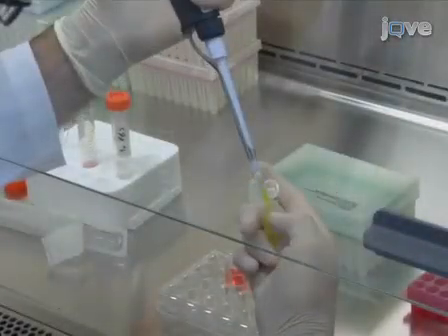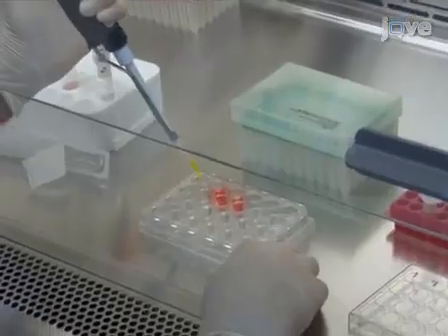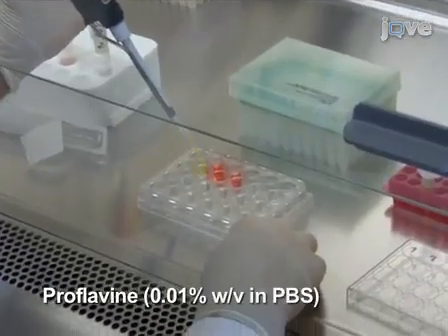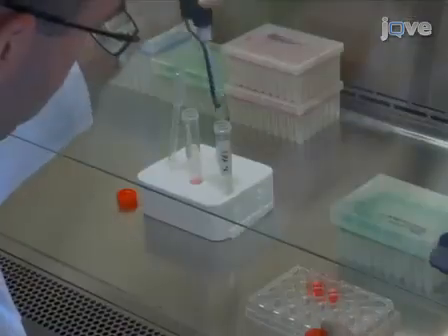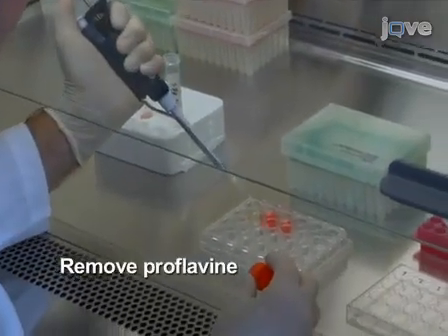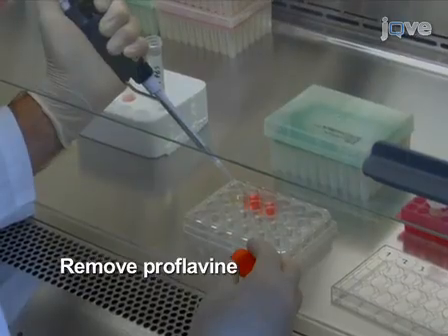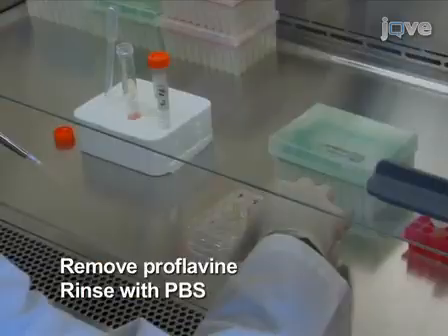Prior to microendoscopic imaging, apply the contrast agent to the cells or tissue to be imaged. To image cells in culture, first remove growth media by pipette, then add proflavin solution by gently pipetting into the well. After a brief incubation of up to 1 minute, remove the proflavin solution by pipette and discard. Rinse the cells by adding and removing fresh PBS solution to the well.